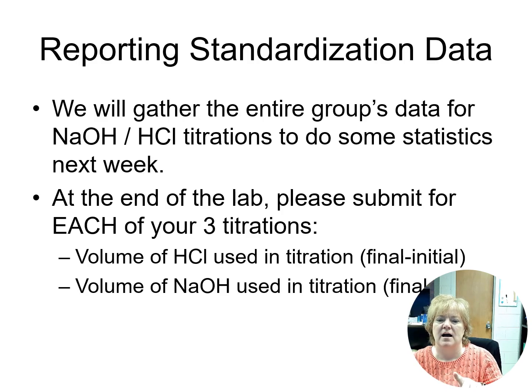One more thing. We are going to need to do standardized data on the Part A titrations. So at the end of your lab, I need to have the results, the volume of HCl and the volume of NaOH for your first 3 trials that you use for Part A. I don't need the Part B with the tartaric acid.